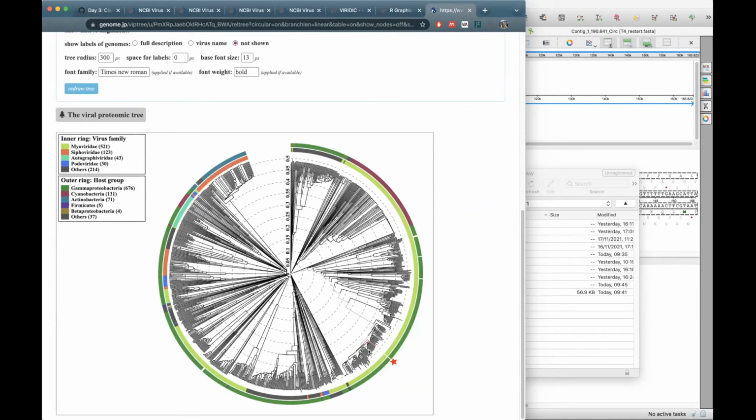For example, if I wanted to reassess the whole group that my phage would be similar to, I can choose this whole clade, or go further and choose the whole of this, or even further. Once you reach here, there's no shared similarity anymore.